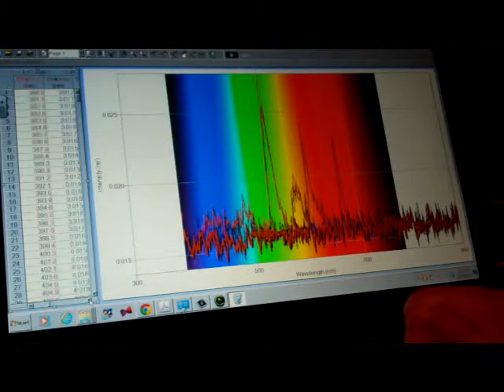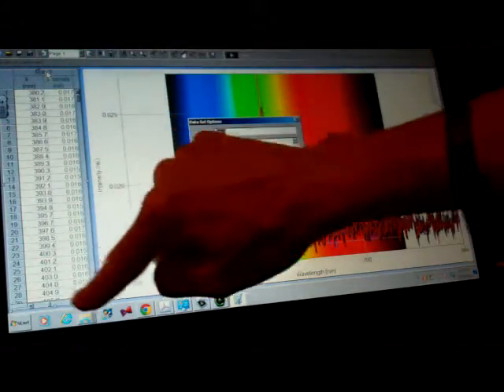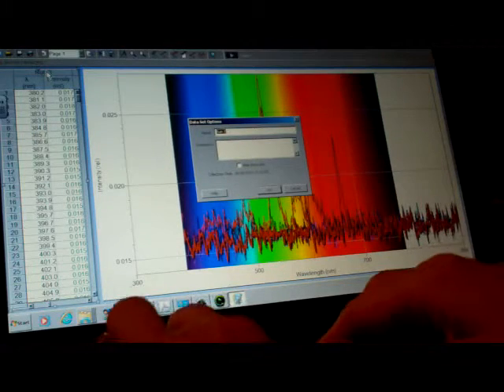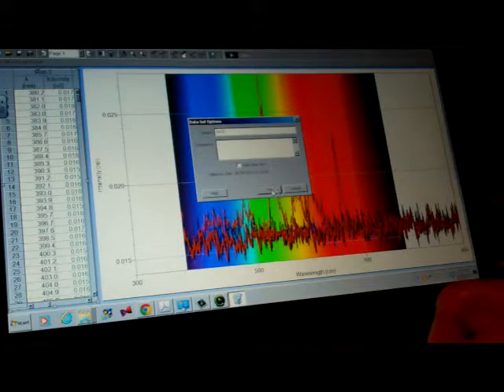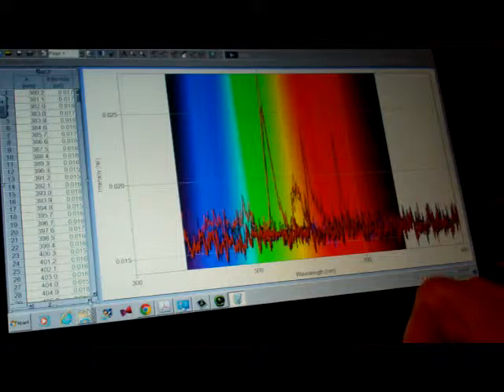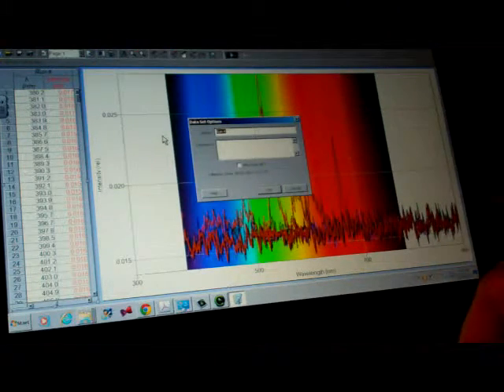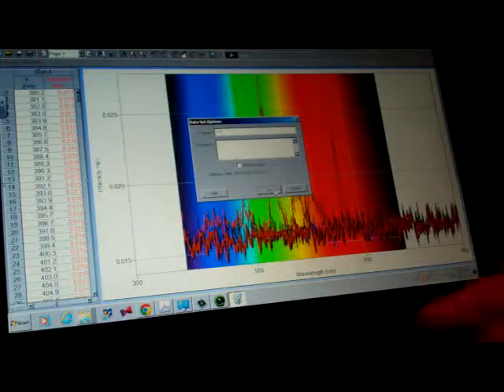Following the steps of the experiment, in run 3, I arrowed over under the data set, I'm renaming that sodium chloride and clicking OK. Scrolling over on the bottom, run 4, double click on run 4. This was potassium chloride and clicking OK.